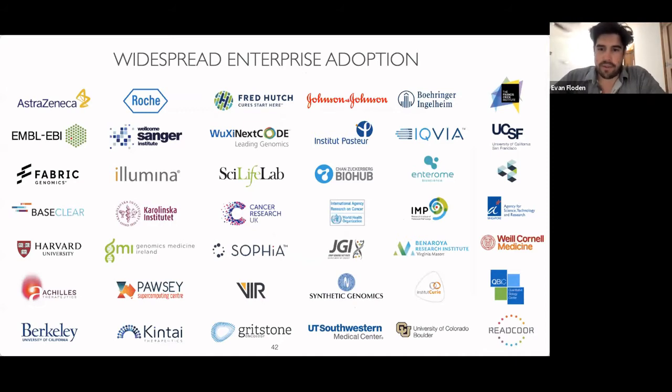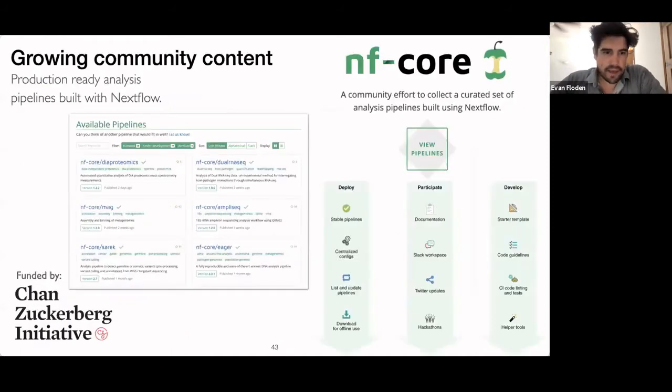Okay, and we're going to see much more of this tomorrow. nf-core has been a big part of that growth, and both Seqera and the nf-core projects, and Nextflow, have been funded by the Chan Zuckerberg Initiative, really to grow this aspect of it, to build these pipelines themselves and to come together around sets of standards for doing so. This really has been a huge part of that growth.